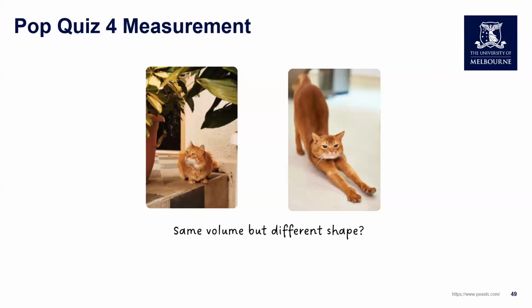Because when we just do standard pixel-based colocalization or object-based colocalization, we are really limited by the size of the pixels and the resolution. So it's more like an indirect measurement that the fluorophores are close together rather than the actual, functional interaction. Yeah. And yes, it measures the correlation of the pixel intensity.